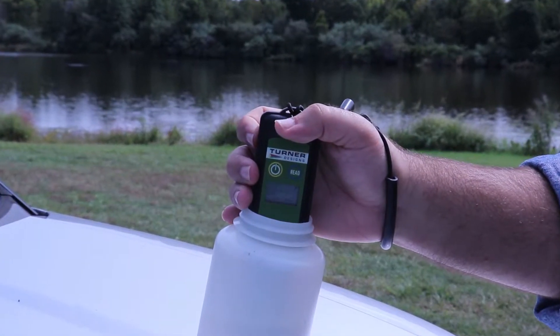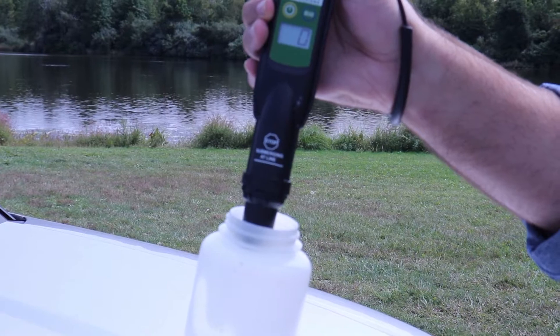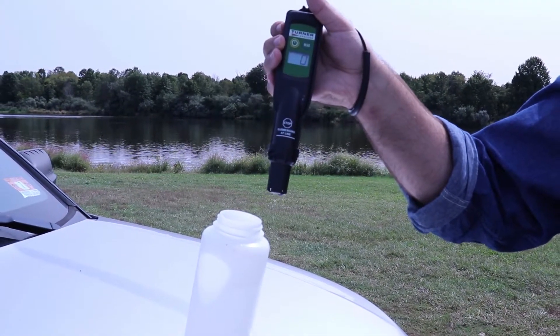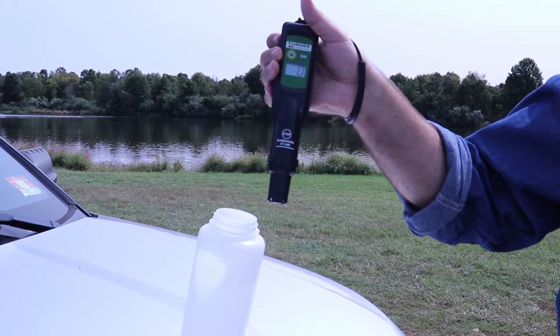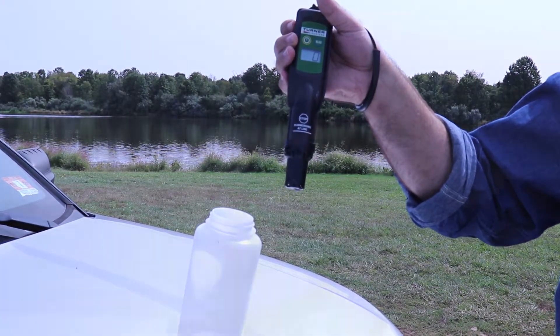The Bureau of Freshwater and Biological Monitoring will check the calibration of meters used by partners before each season. Before each use in the field, partners should check the meter by taking a reading using tap water dispensed into a cup or bottle. If it is above zero, contact the Bureau of Freshwater and Biological Monitoring.